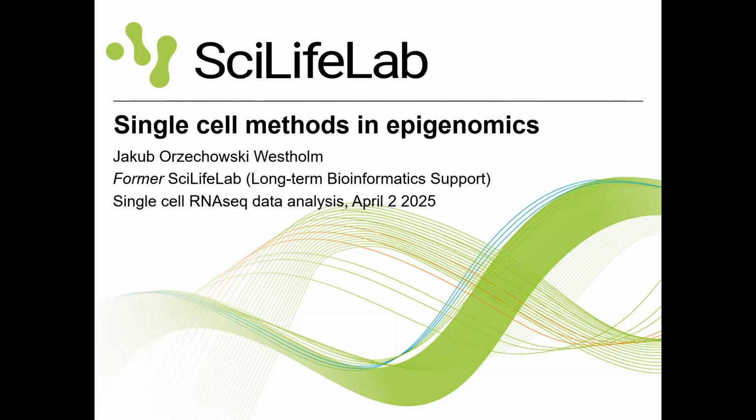So could we do QC in the ATAC-seq data and then interpolate it to the transcriptomic data? Yes. You can do QC on both, and you can see how well they agree, and you can use both of them for your filtering. Great, thanks.